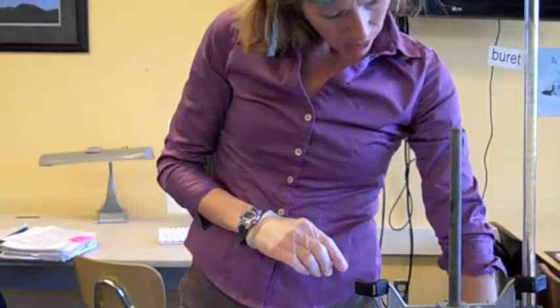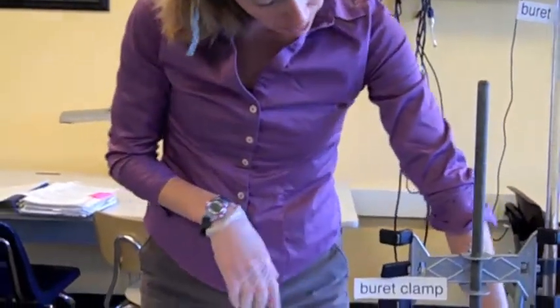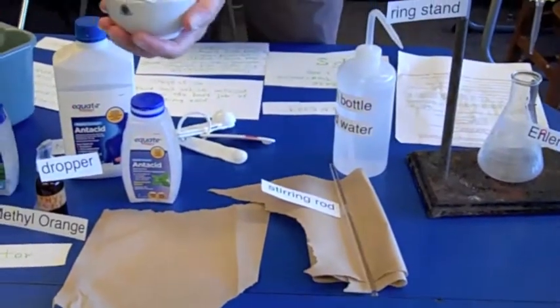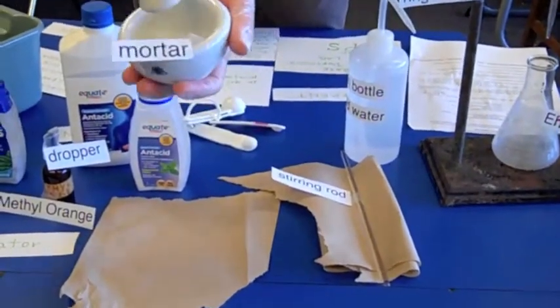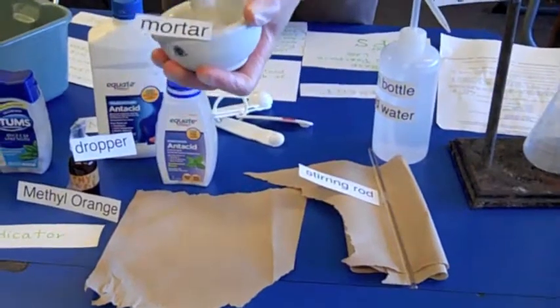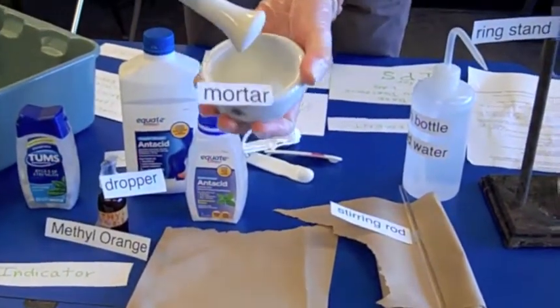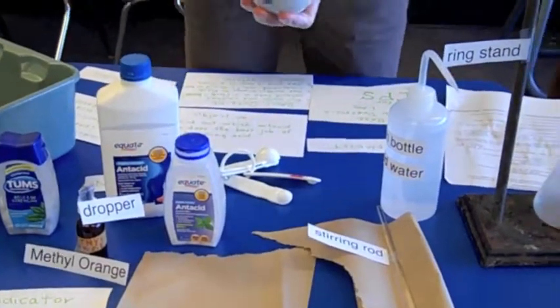Step 2 includes crush the tablet with the mortar and pestle. So I would add that Tums tablet to this mortar and crush it with this pestle. And take your time. This should take 2 or 3 minutes at least to get it crushed down to a fine powder. How come you're only using one tablet?